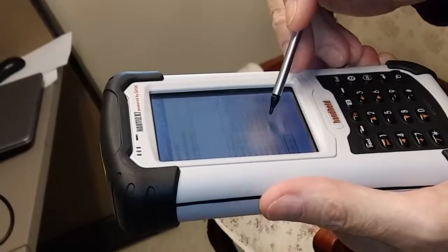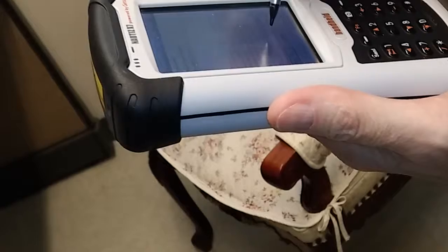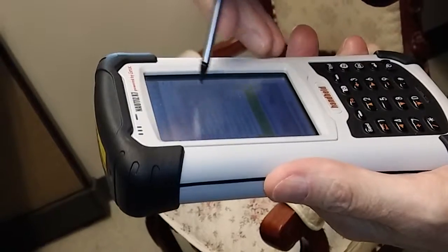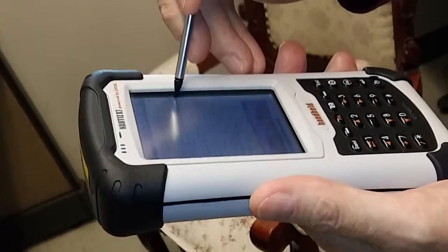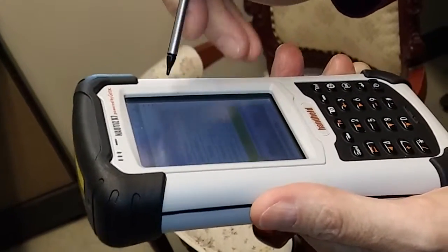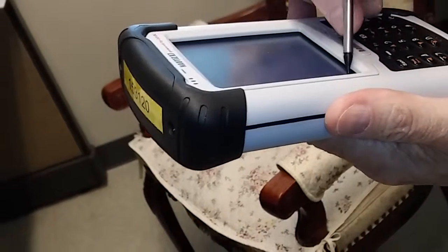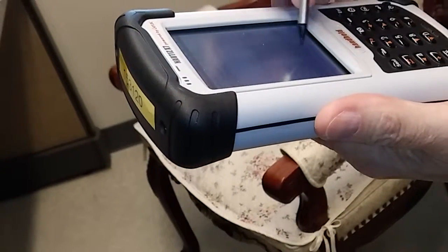Okay, so at 10:20 we took a spectrum reading. So supposedly that should come up, and I should be able to open the file, and this is what I got when I opened the file for that particular time period. So it kind of logs it for you when you do the continuous monitoring. So you go back to file, you open the spectrum. It gives you the times right here.